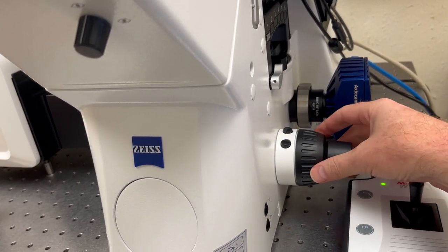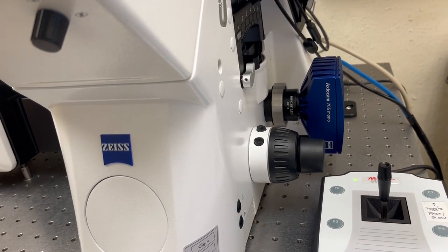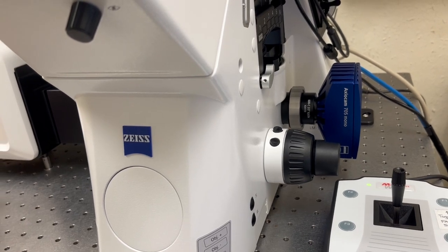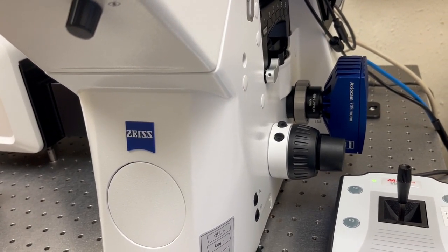Be aware that when you're rotating this away from you, you are moving the objective closer to the sample, and there's no stop that will automatically stop you from crashing into it, so you have to be aware that that's not going to happen — we'll discuss that more in the trainings.